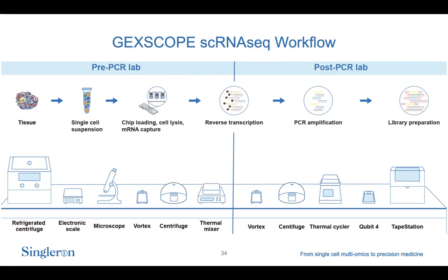And these PCR products can contaminate what you put into your PCR mix, which you are preparing. So basically, if you do not split the pre-PCR workstation from the post-PCR workstation, you could get some PCR product contamination from the previous runs.